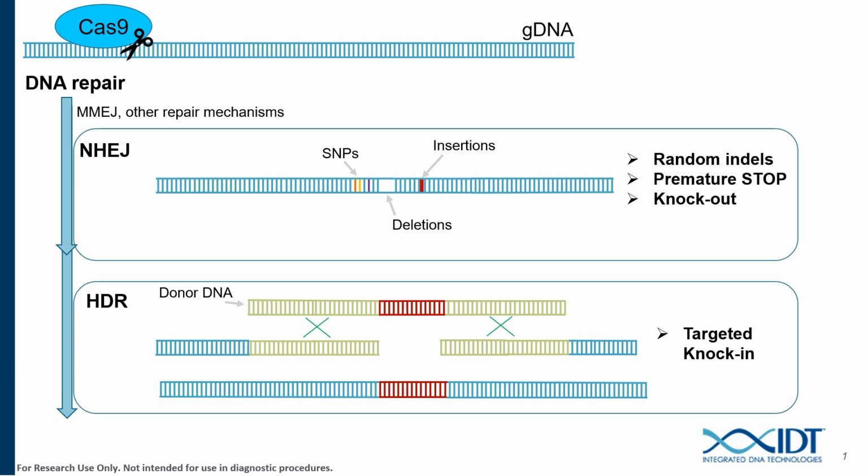So following a double-strand break, there are a few different repair pathways that the cell can use for repair. Non-homologous end joining, or NHEJ, is most common for making a gene knockout because it gives rise to random indels. Mainly today, I'll talk about another pathway called homology-directed repair, or HDR, which is when a sister chromatid, or alternatively, an exogenous donor repair template can be provided that the repair machinery uses to repair that double-strand break site and can bring a desired insert along with it.